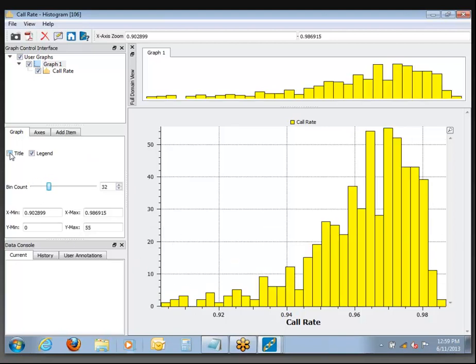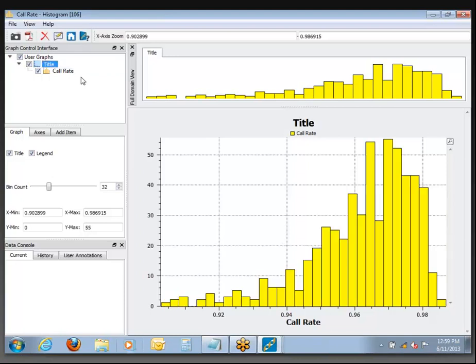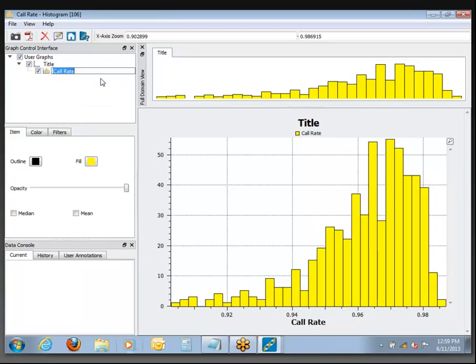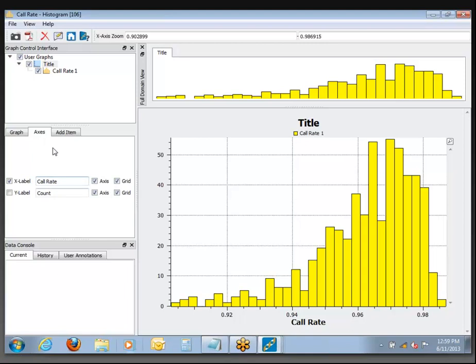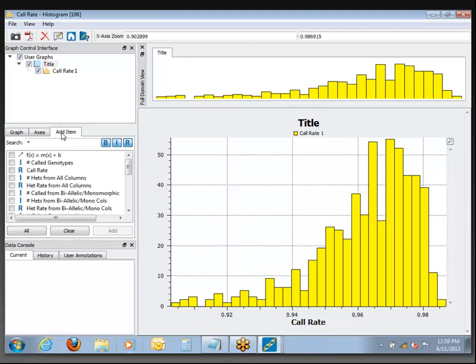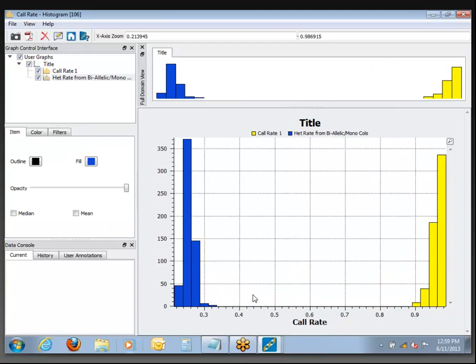You can also control whether or not the title is shown and what it's changed to. You can change the legend item and axis labels. If you want to add another histogram inside this same window — for example, putting the heterozygosity rate on top of it as a second plot item — it will draw that in. Since it's distributed much lower, it gets put down at the bottom end, but you can see you now have two histograms in the same window.